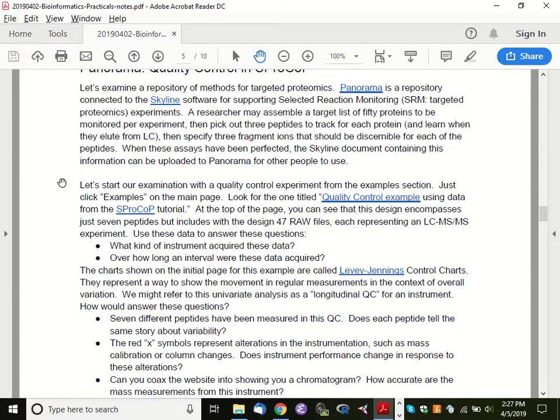Laboratories who've done really exhaustive studies where they all have the same sample and are running them on different models of instruments in different places have found that you can reduce the variability of targeted proteomics experiment to a coefficient of variance of, say, 12% or less. That's not terrible. That's still a good bit of variability among the results, of course. We'd love for that value to be 1%, but a 12% variability means that you can use these for finding relatively small differences. Remember, from difference testing, the lesser the variability of your technical variation, the better your ability to find small biological differences reliably.